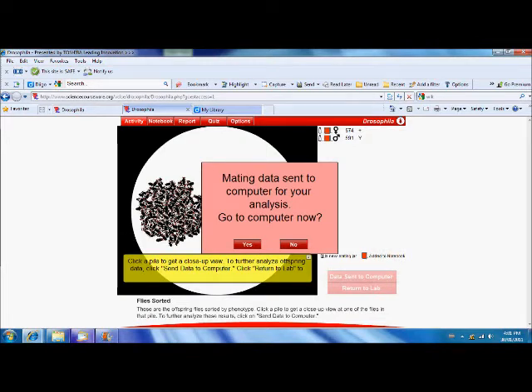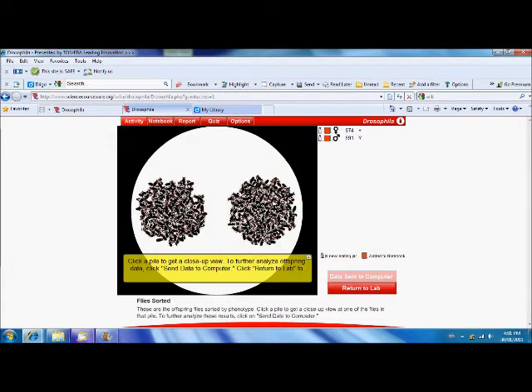Now, let's add all of this data to a computer. We have to do a second cross. So, we're not going to analyze our results quite yet. So, let's click no. And return to the lab.